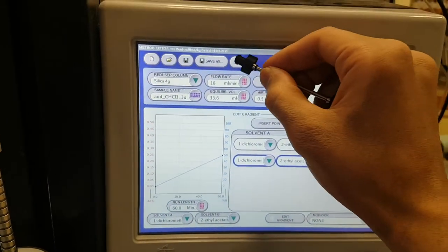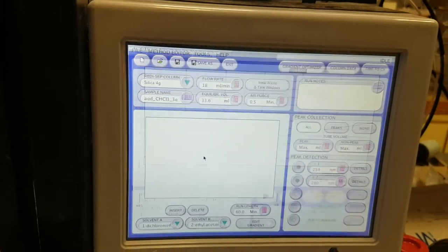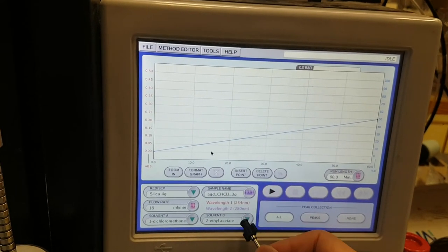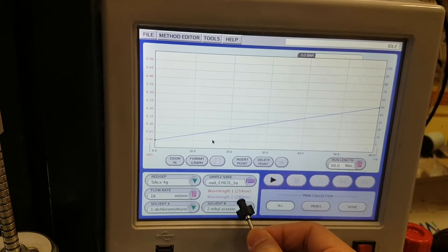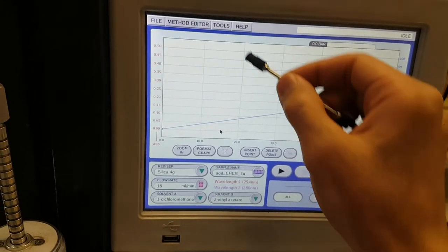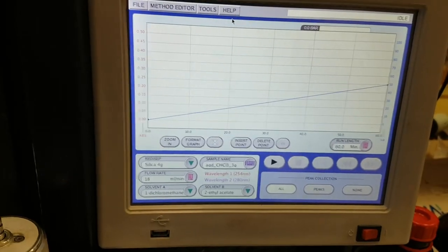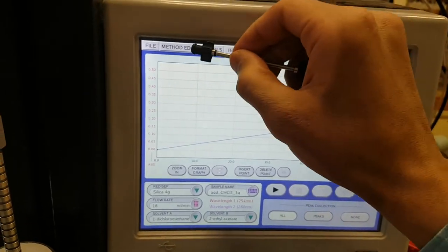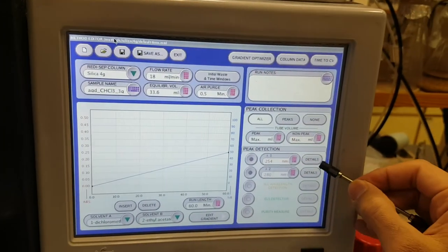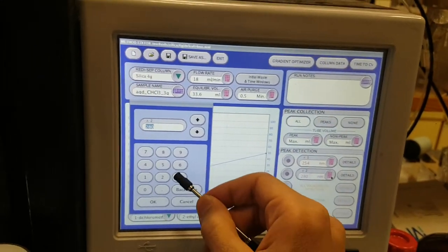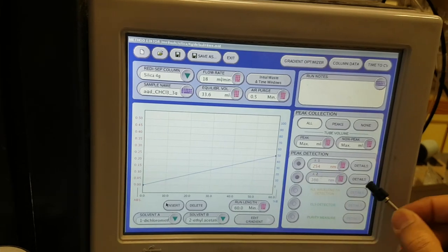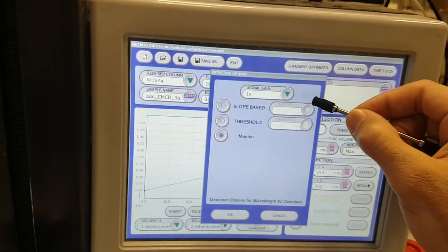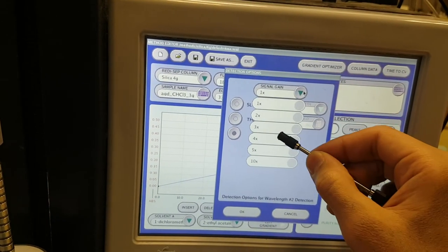I'll choose also the wavelength. I need to change 280 to 366. I'll go back to method editor and here you can change 366. I'll make it five times.